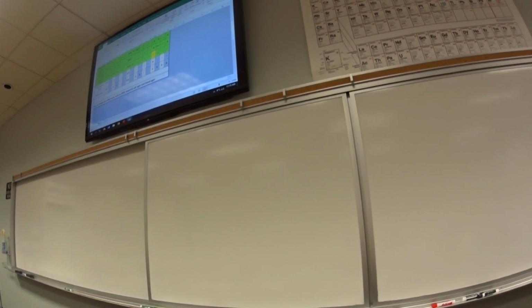Pretty much you've worked with most of them, and Corynebacterium xerosis is the only one you haven't worked with. So first off, if you look at it under the microscope, and it's cocci, you have a mix of gram positive and gram negative. What should it be?